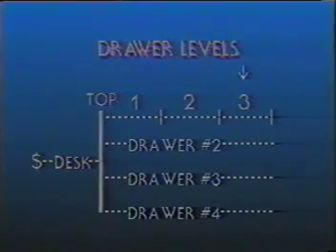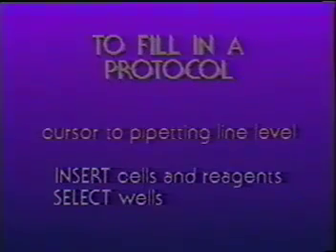To bring the cursor back to desktop level, you can give the up level command 3 times, or to save time, you can use the Enter T macro, which brings the cursor to desktop level in one jump.